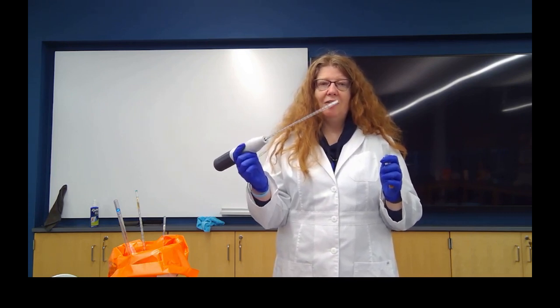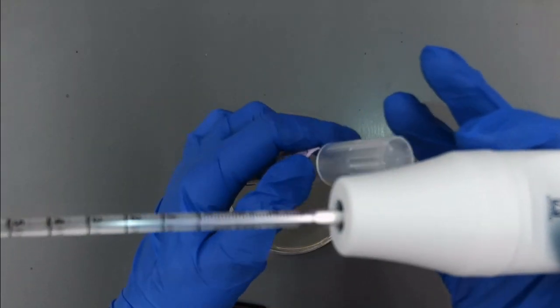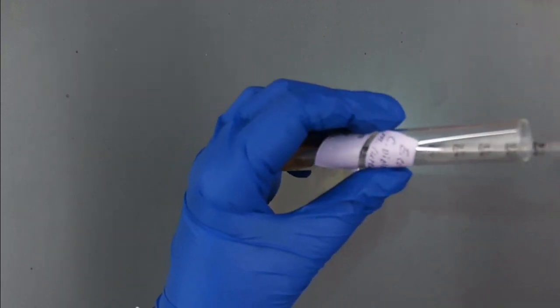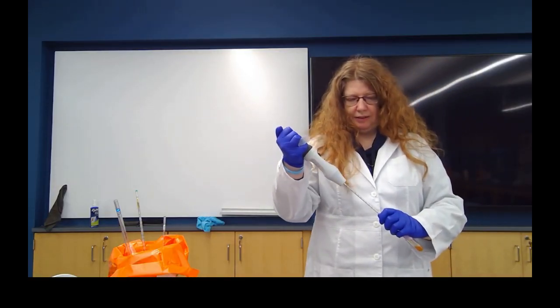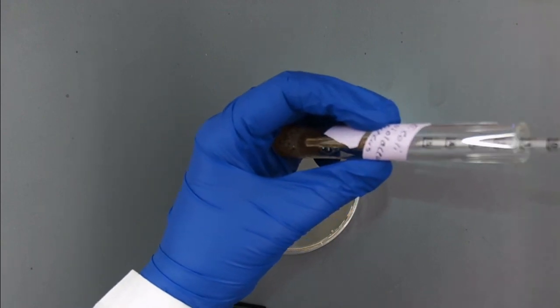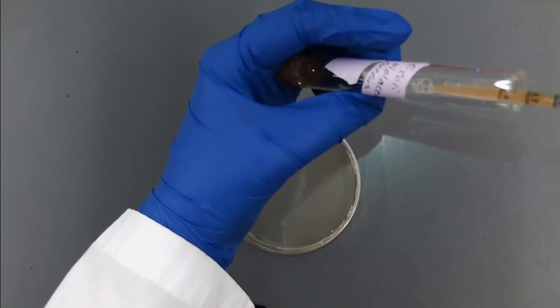Now I'm going to take my tube with the bacteria and I'm going to pipette 1/10 of a milliliter. Using my pinky to remove the cap, I'm going to insert the pipette, press up on the lever, and you can see I have liquid in the pipette. I'm going to recap my tube.